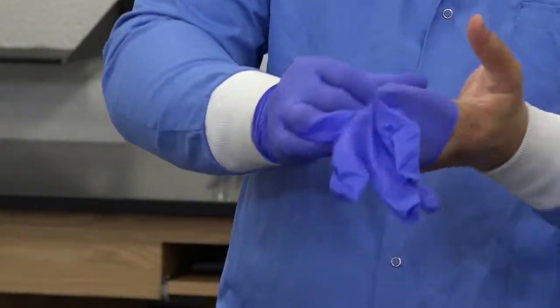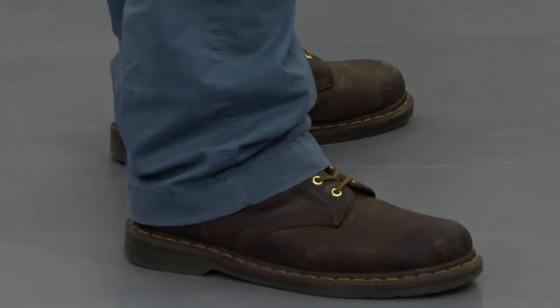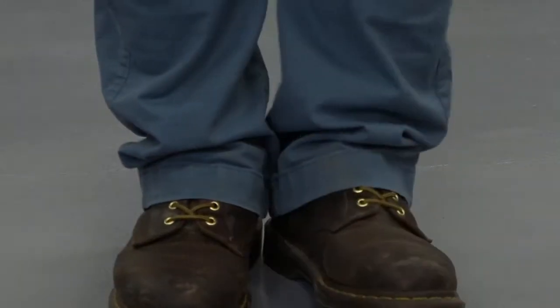All right, and for the next part, before we begin the experiment, let's make sure we have our personal protective equipment, like our lab coat, gloves, and goggles. And of course, we want to have our pants covering our ankles and toes. Let's get started.